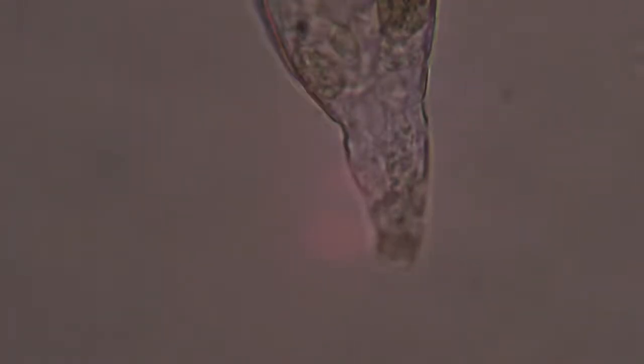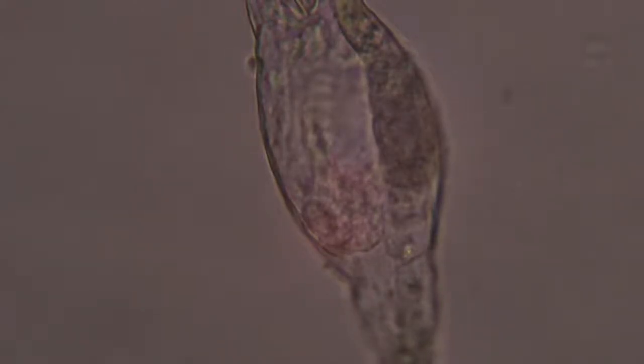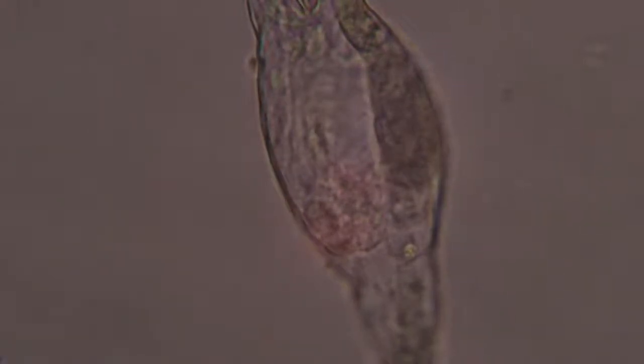Zoom out here a little bit, or change angles. I think I got the magnified view in OBS again. It kind of freaked out on me, so I have to move around more than usual. So that's the head of the rotifer, and then as you go down, there's the body. And that little coffee bean shaped thing in the center with a split in the middle, that's the mastax. It's always chomping away when they're ingesting their food, chomp, chomp, chomp.